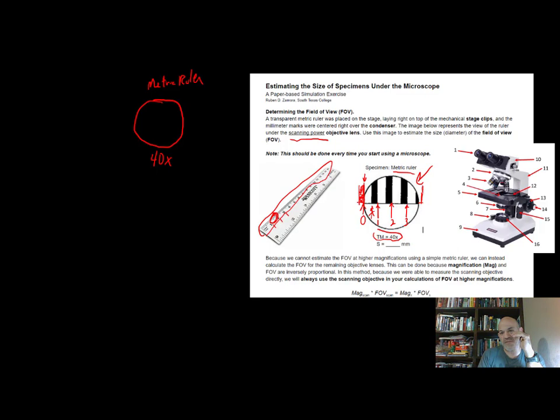So it is actually less. So you have to use your imagination, a little bit of estimation, where you think that other mark is outside of the field of view. And when you do, from here to here, this imaginary line out here is 4 millimeters, but we're not. We're somewhere between 3 and 4. And so the halfway mark is probably around here. So that would be 3.5 about. But the edge is right here. So that to me looks more like 3.7 or 3.8. I'm going to go ahead and call that 3.8. So that's 3.8, and the units would be millimeters.